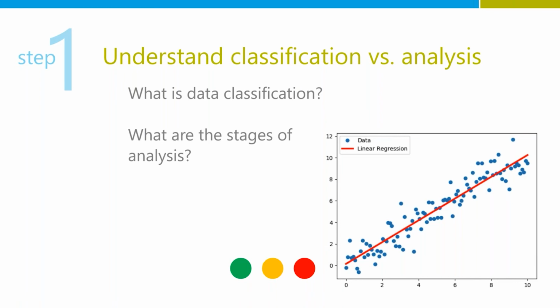But what you're looking to do is apply a conditional state to that data point, letting you know whether it's in a good condition. Maybe it's not necessarily in a good condition, but it's not bad, so it's in sort of a caution state. And then you have the bad state. Hey, this data point came in, and based upon our levels of analysis for these classifications, it's bad. So you might mark it as such. So yeah, in a way, it's a type of analysis. The classification uses the analysis to get to that level, but to apply to that individual data point.